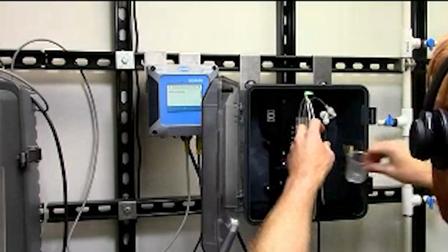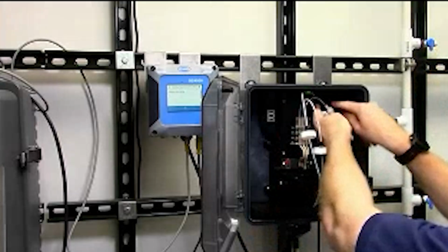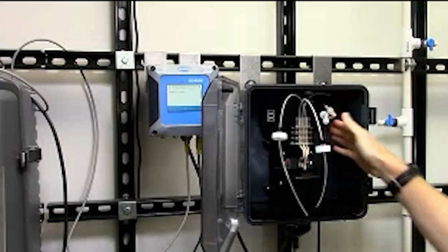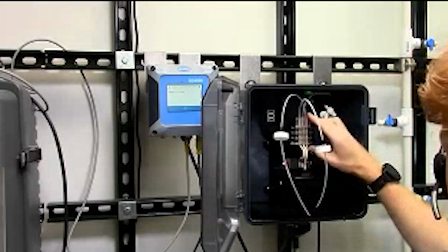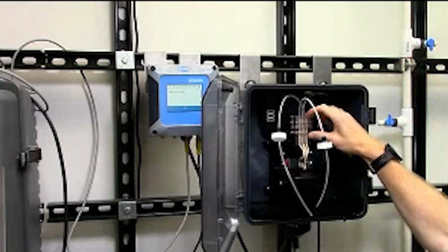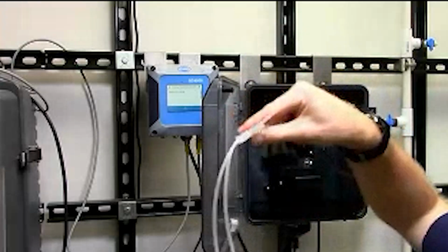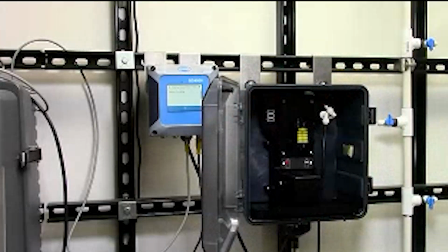Next, I'm going to disconnect my sample stream from my flow meter up here, another improvement over the old style. And what I'm going to do is remove this pinch plate and pull out my old tubing kits. Again, if you're coming from the legacy instruments, this probably seems much easier in comparison to the old style. To do our colorimeter cell cleaning, I'm going to showcase that as well.